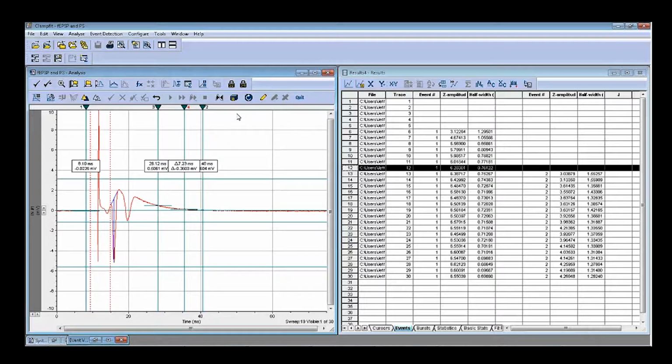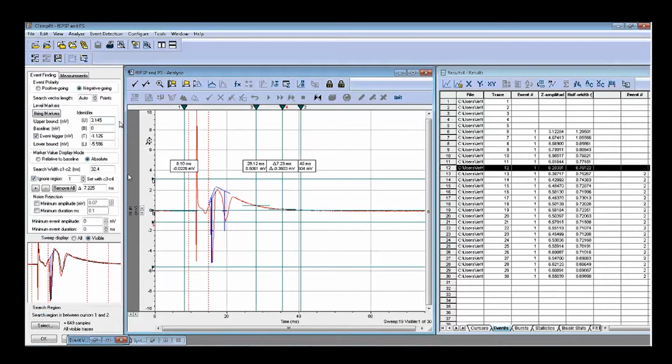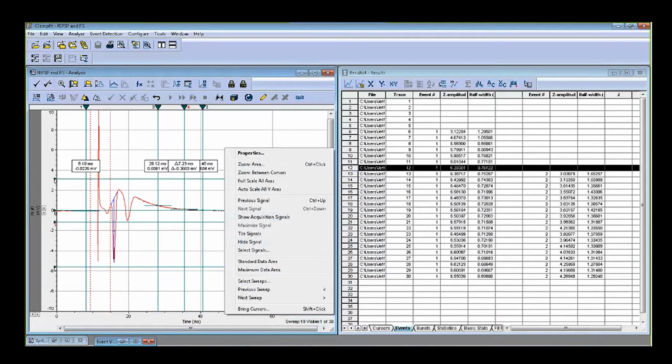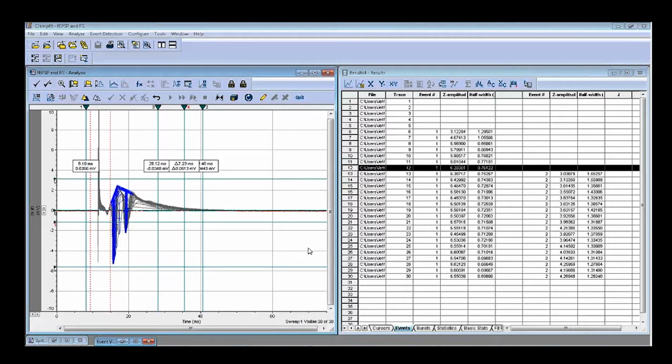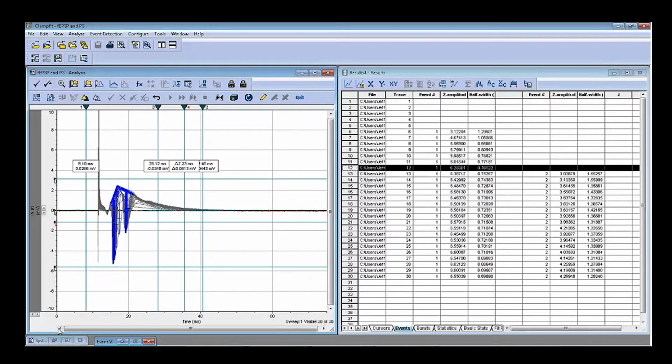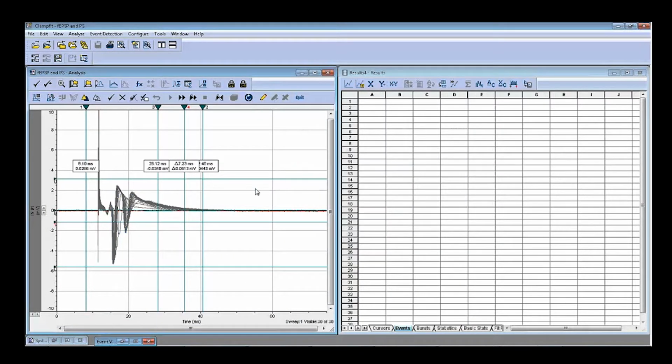So anyway, again, I also want to show you one more thing, that before you do the search, you are able to modify the search parameter. Let's do it one more time. Like in here, okay. Let's cancel again. Let me bring out all the traces here. Right. Now we go to here. Then we can remove all. Okay. Now let me put here. Okay. Let me hit OK. And we do it. Now, this one, do you like it or not?